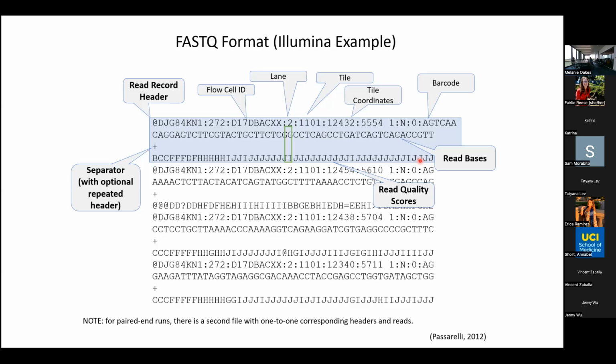Now, sometimes we have a problem. We had a problem in that somebody didn't provide us their correct barcodes. Rarely does it happen, but it does. In that case, I had a client that was getting reads that weren't theirs. So then I have to go back and figure out how I'm going to solve the problem. In one instance, I went back and said, you need to pay for the resequencing we had to do because your postdoc didn't give us the correct barcodes.